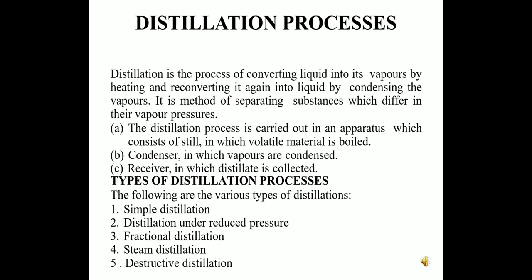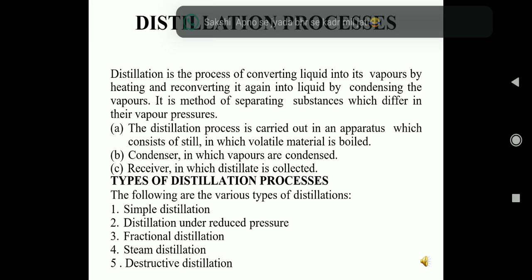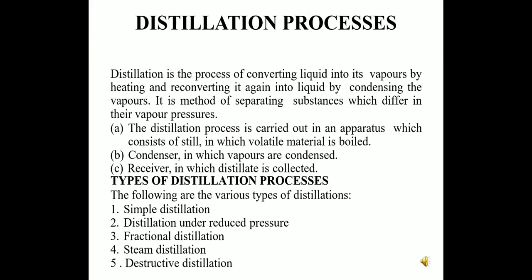Distillation is the process of converting liquid into its vapor by heating and reconverting it again into liquid by condensing the vapor. It is the method of separating liquids which differ in their vapor pressure. The distillation process is carried out in an apparatus which consists of a still in which volatile material is boiled, a condenser in which vapors are condensed, and a receiver in which distillate is collected.